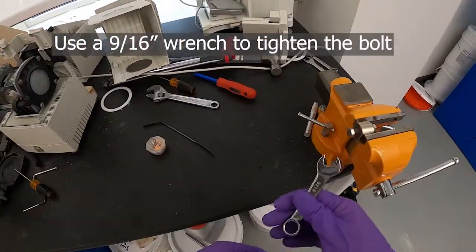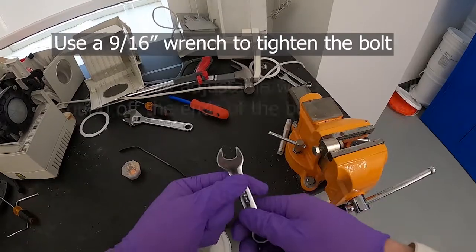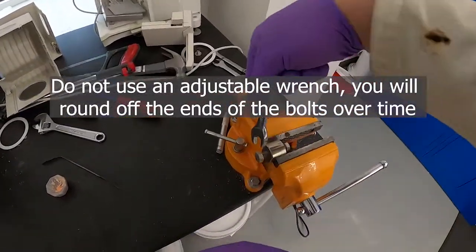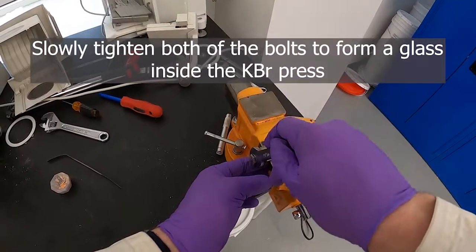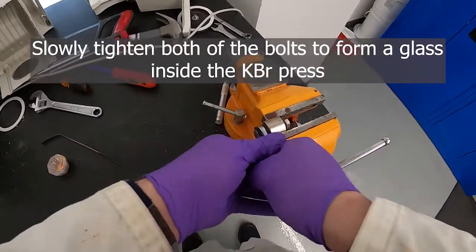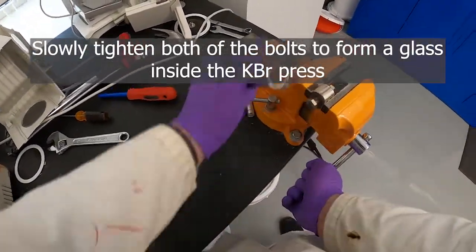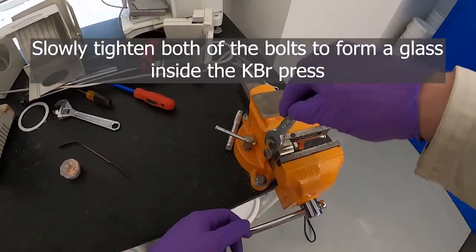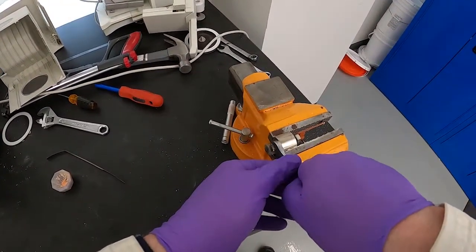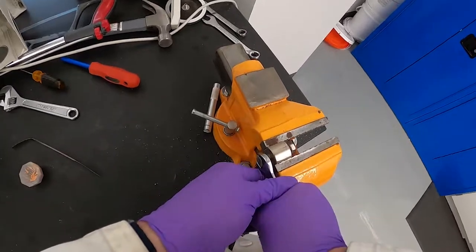Clamp it in there nice and tight. These bolts are 9/16 head size — it's important to use an actual wrench and not an adjustable wrench, because this kind will round off the bolts and then you won't be able to use them anymore. Once that's in there, tighten the bolts. You essentially want to use your body weight to get the press a little bit tighter — I'm pushing on that just about as tight as I can.